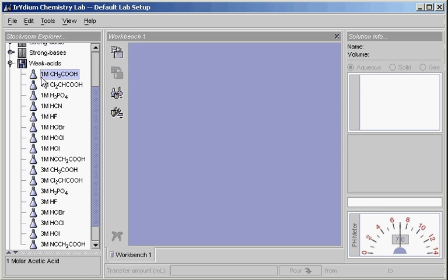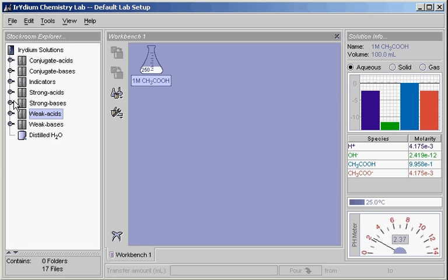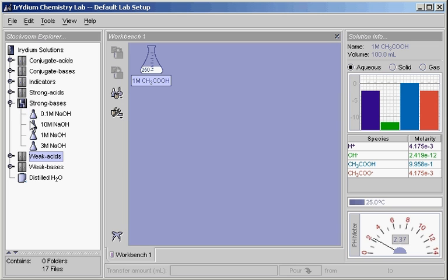To bring a solution out of the cabinet, double-click on it or select and drag it onto the workbench. By clicking on a flask, you can select it and view its details in the solution info panel.